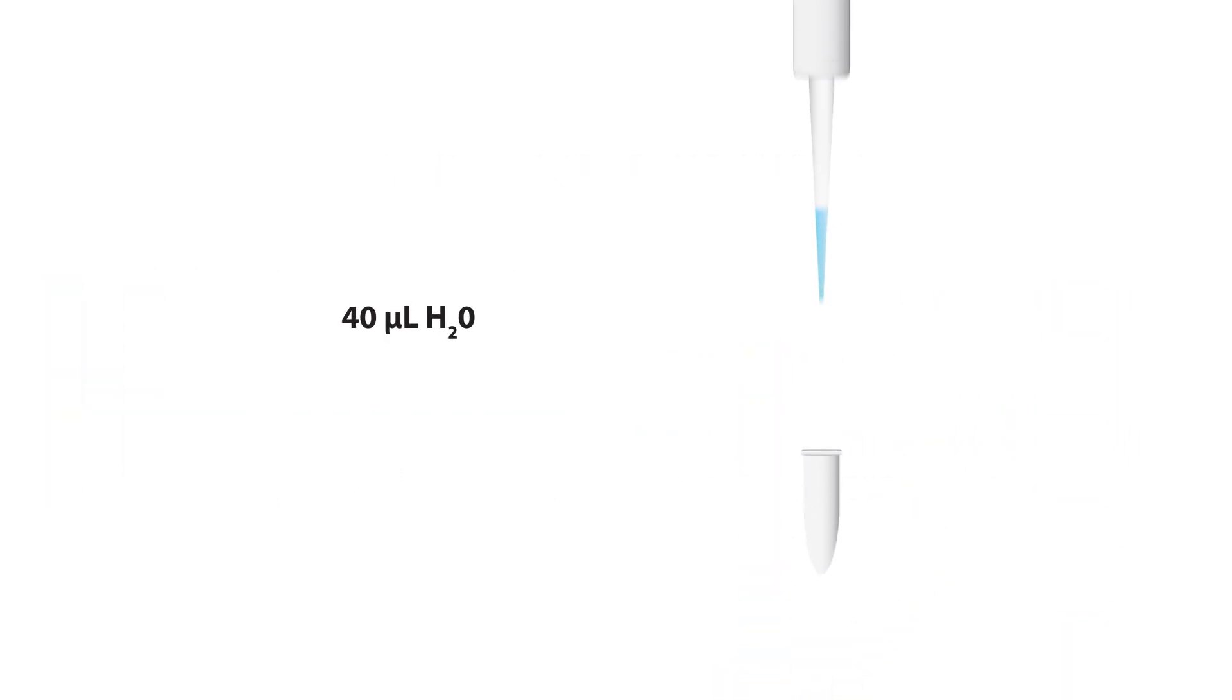Add 40 microliters of water to the DTT tube. Mix by pipetting up and down.